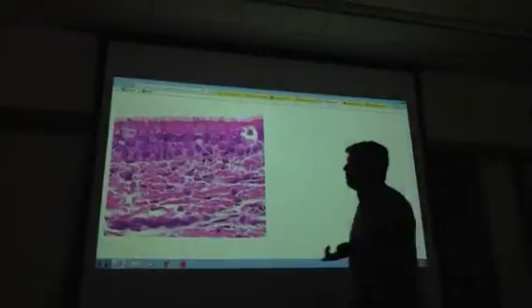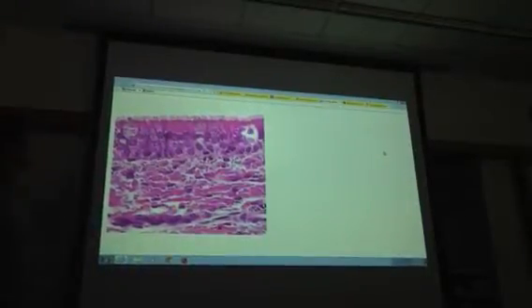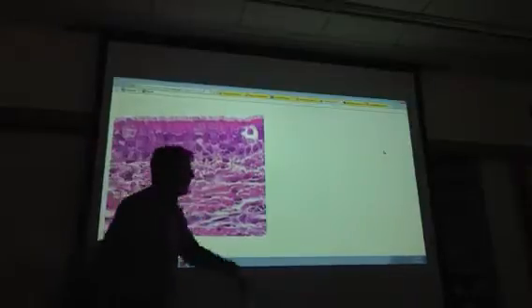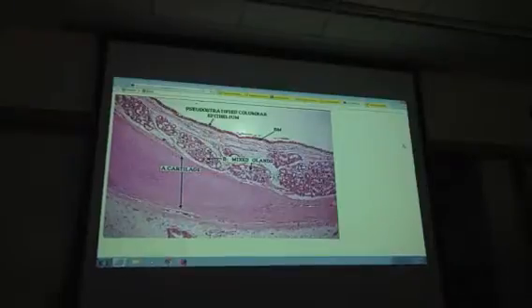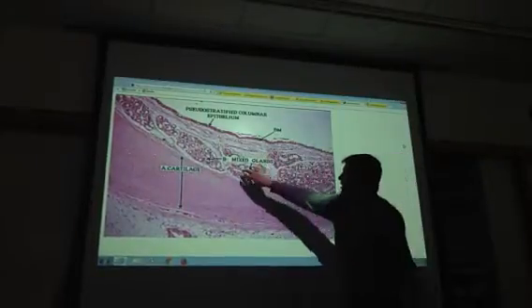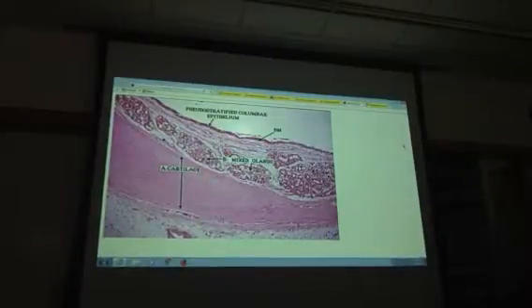Oh, still more. Here's a super duper close up of the epithelium. You can really see the little cilia well on that level of close up. So there's the epithelium. There looks like some goblet cells there. Maybe another one here. It's kind of tough to tell. This all would be part of the lamina propria. Still can't get enough. All right, so one more. I think this is the last trachea one. This one has a lot of glands. That's the only reason why I brought this up. All these little things are clusters of what are called seromucous glands. Here they're calling them mixed glands, but seromucous is probably a better name for them.